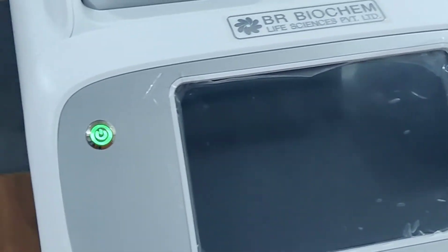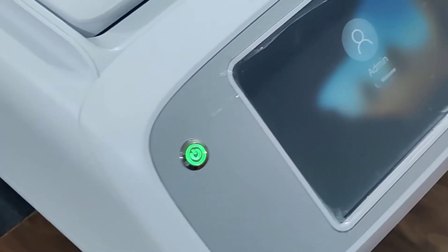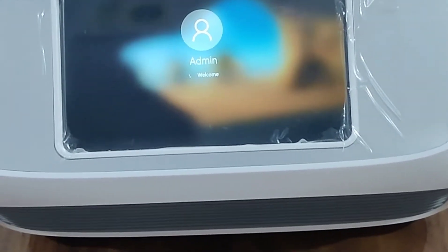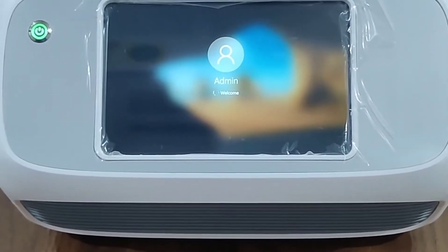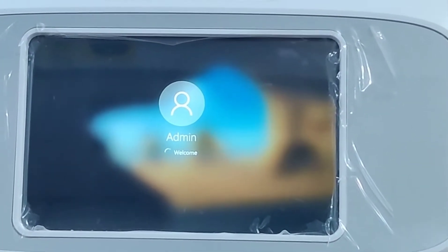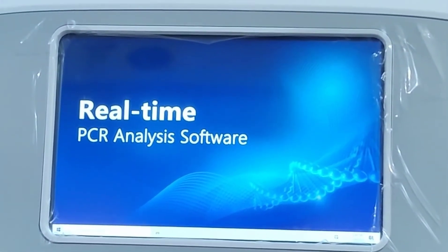It runs on a Windows 10 operating system. It has some more features: small size, lightweight, and easy to carry. The best feature of this RT-PCR machine is that you can directly connect your printer to it.